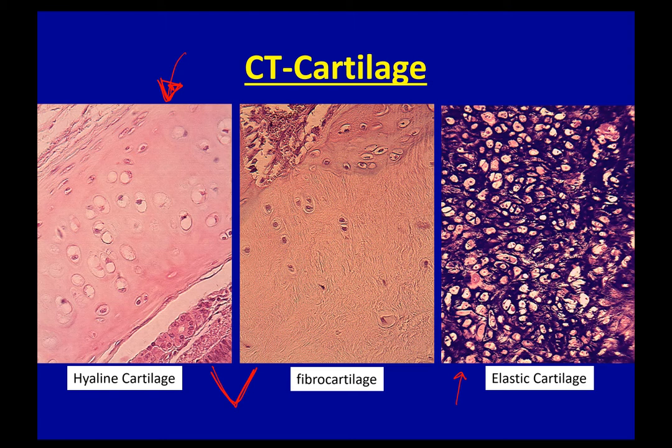Notice that there are no squigglies in it. Hyaline cartilage has that smooth jello look, whereas if you look at fibrocartilage, it almost looks like really fine cat hairs in the jello. It's not smooth like what you see over here with the hyaline cartilage.